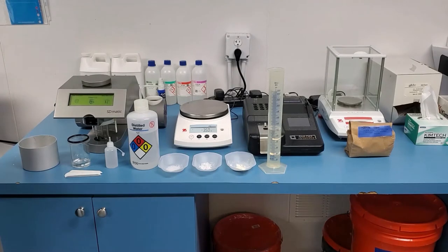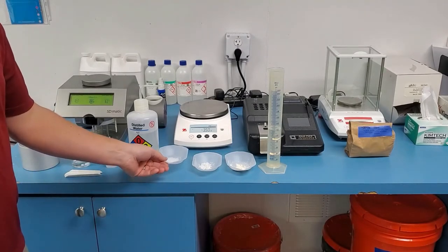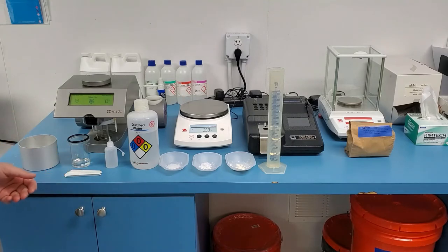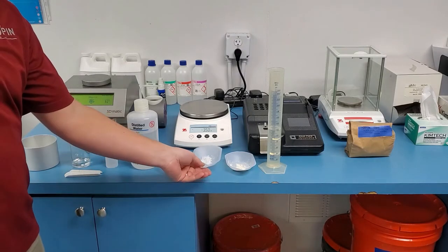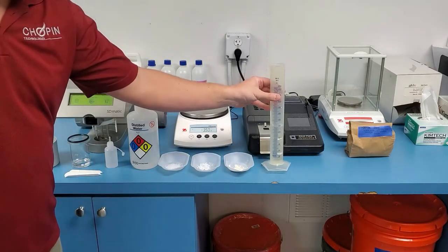In order to create the solution for the SDmatic, you will need two chemicals: 1.5 grams of citric acid, 3 grams of potassium iodide, and 1 gram of flour, along with 120 milliliters of distilled water.